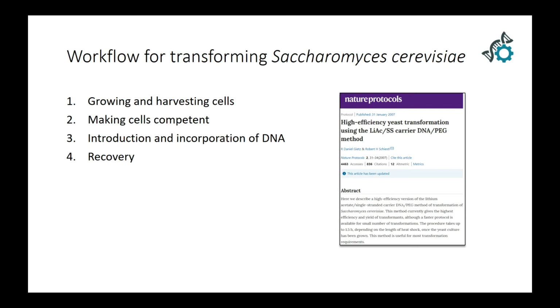I will now run through the protocol for transformation of Saccharomyces cerevisiae, which is the common baker's yeast. The method we are using was described by Daniel Gietz and Robert Schiestl in 2007, and it has been adapted by many labs and many research studies. I will provide a link to this publication at the end of the slideshow.